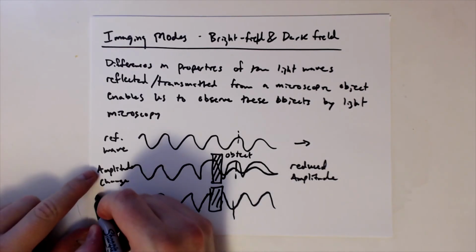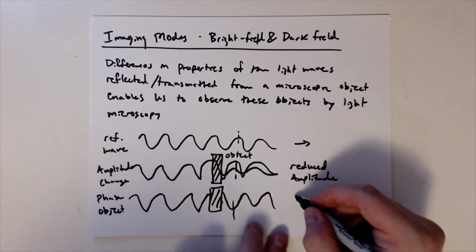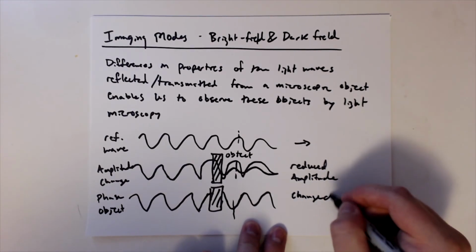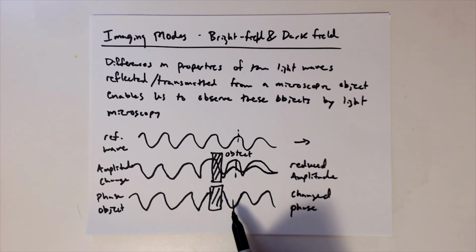So this is a phase object, and we have a changed phase. When I say phase here, I'm not referring to any crystallographic phases in the material. I'm talking about the phase of the wave.